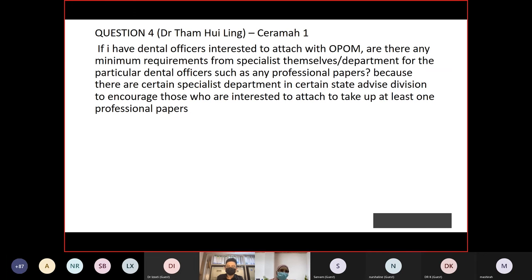But if it's from an outside clinic elsewhere, then they would like the specimen triple packed, and this time it must be in the ice chest box, sealed and labeled COVID.